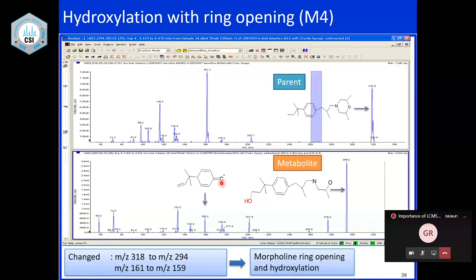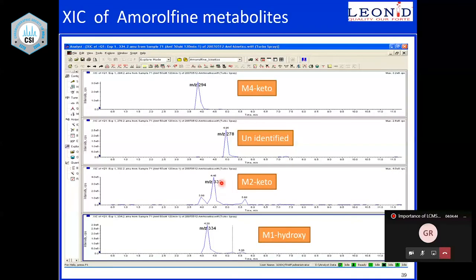Then when you extract the chromatogram for these ions that I was showing, in the TIC you can extract different ions. If you extract these ions, you can actually see these peaks there. Here there is 4.2 minutes, 4.45 minutes, 4.95 minutes, and this is at about 3.8 or something. Okay, these are all the ions you actually physically saw in your plasma mixture, metabolite.